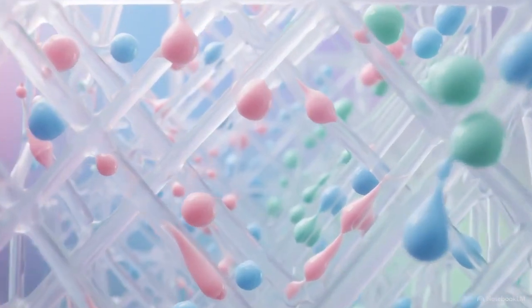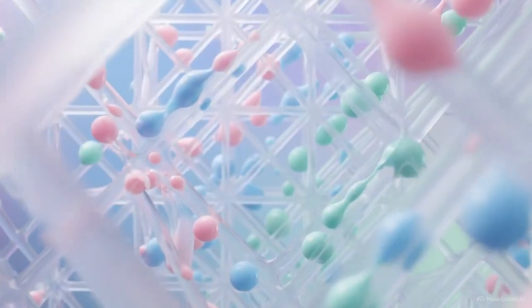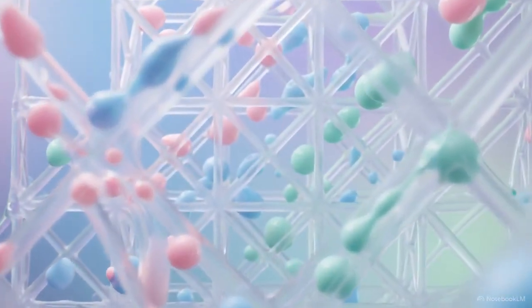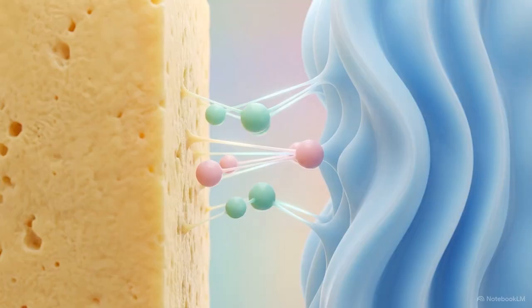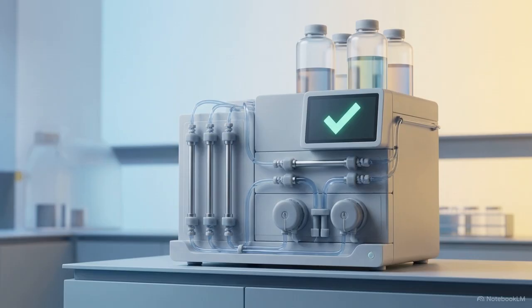Inside any HPLC setup, the column is the absolute core of the analytical system. It is where the actual chemistry happens. A successful separation relies entirely on the precise push and pull your compounds experience as they travel between the stationary phase inside the column and the flowing mobile phase. This single hardware choice dictates whether your method is accurate, reproducible, and ultimately capable of passing strict GMP compliance standards.